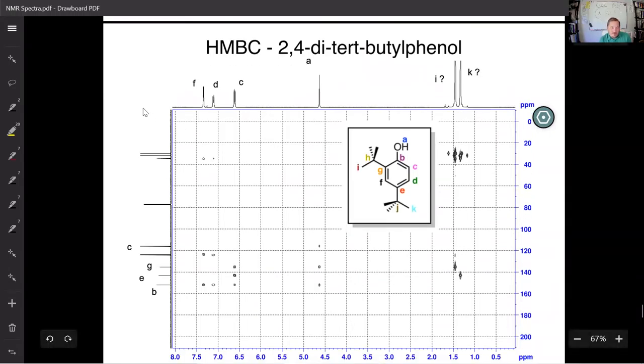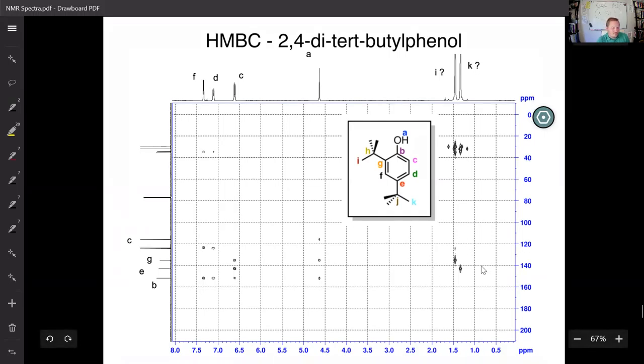But I did see, go back to this fully zoomed out HMBC. The proton one might be helpful, right? Because the proton, so 1 bond to the oxygen, 2 to the carbon. No, that just gets you to G. So you still can't tell H and I from the proton. C, the proton associated with C, 1, 2, 3, that just gets you to G. Yeah, I think you're going to have to, well, actually, once you can assign K and I. I think I figured that out.